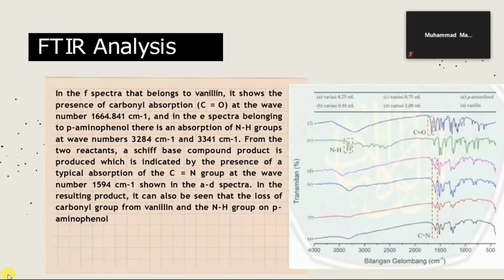From the two reactants, a Schiff-base compound product is produced, which is indicated by the presence of a typical absorption of the imine group at wave number 1594, which can be seen in the A until D spectra. In the resulting product, it can also be seen that the carbonyl group from vanillin and the NH group from p-aminophenol are lost.